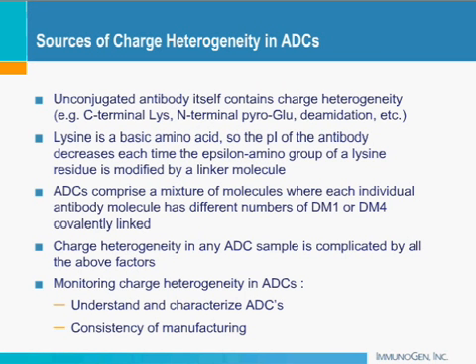So this one just talks about basic sample preparation and ICIEF analysis, and a lot of this was covered by Scott in the beginning, so I'm not going to go into much detail. It just involves a sample prep wherein you add your analyte into a proper amount of methylcellulose, ampholytes, PI markers, and other additives. And then analysis is done on the fluorocarbon-coated capillary with anolyte and catholyte solutions. And then the detection is done using a CCD camera at 280 nanometers wavelength.